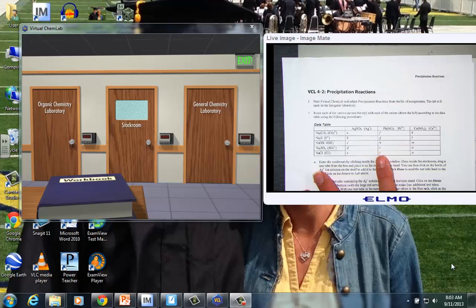In this lesson, we're going to take a peek at Virtual Chemistry Lab 4-2 Precipitation Reactions. It's the second virtual experiment.